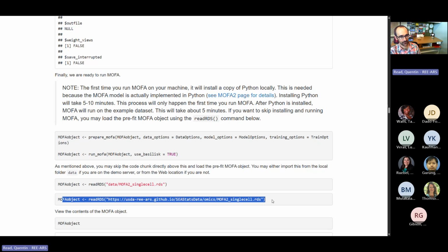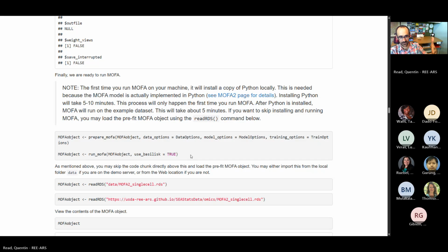That would probably be the easiest thing, unless you ever want to do this again, in which case you should go ahead and run it, and it only has to install everything the first time. So that's kind of up to you there.